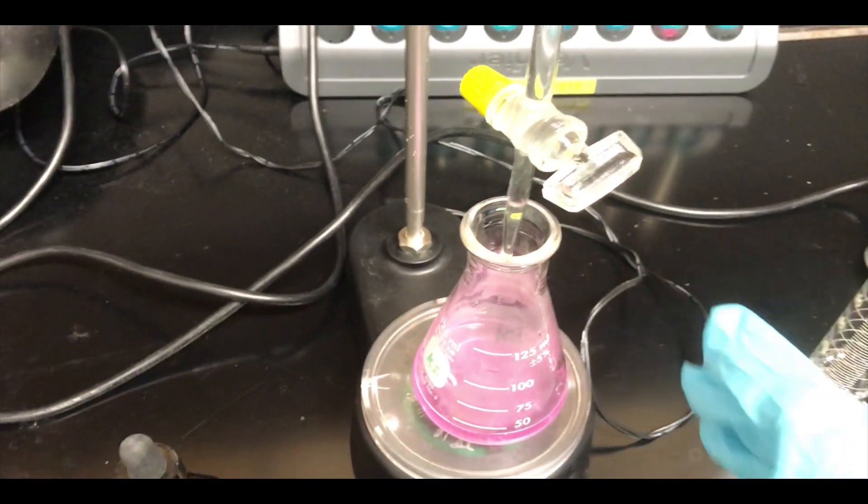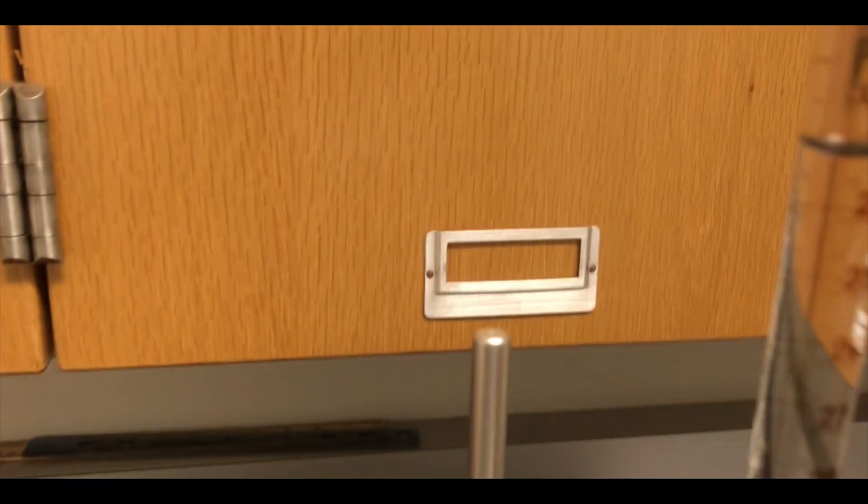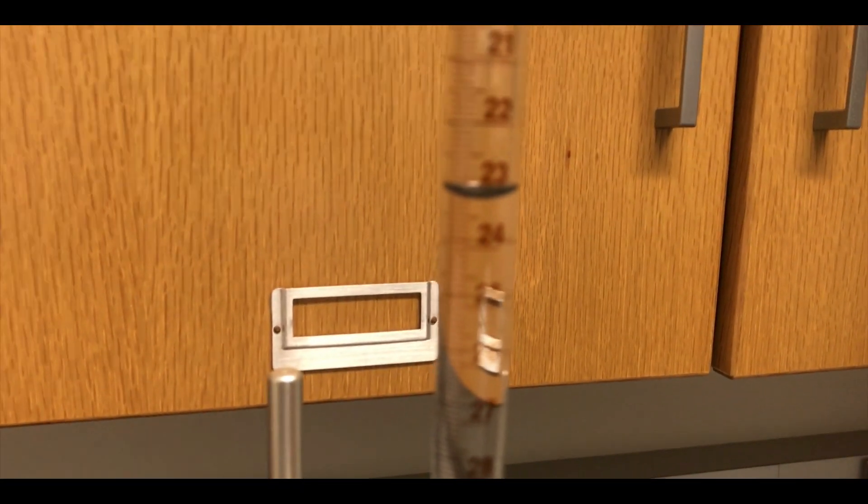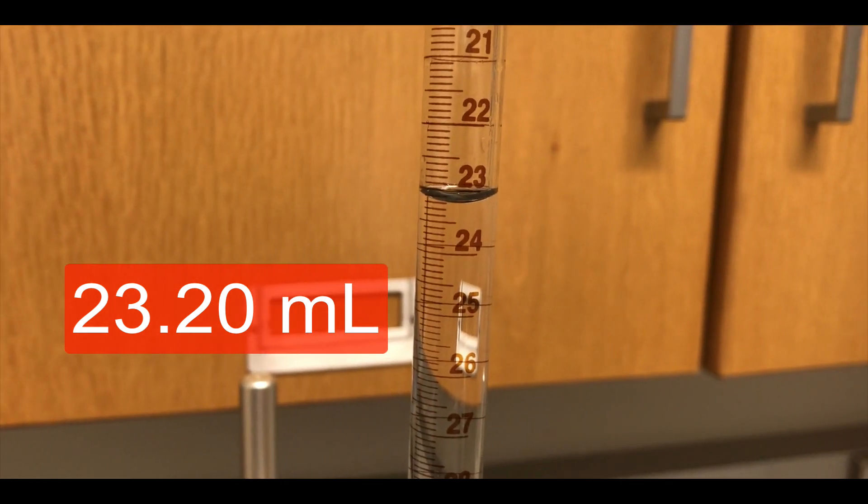So now that we've done that, let's go back up and see what our initial volume of hydrochloric acid in the burette is here. And this looks to me to be about 23.20 milliliters to start.